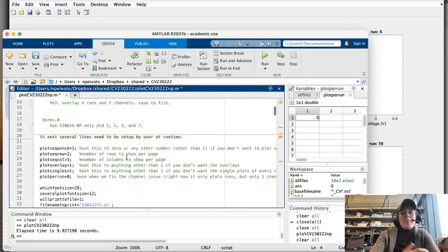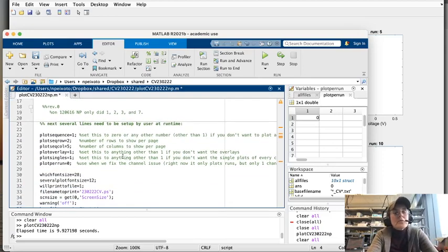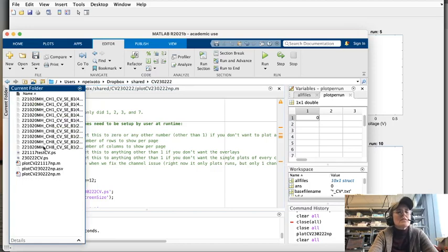So I am testing this with 10 files that Hassan sent to me, but looking at the text files, they're all sort of saturated. So this is really for testing the script. You see here there's 1, 2, 3, 4, 5 of this channel, and there's 5 of another channel.